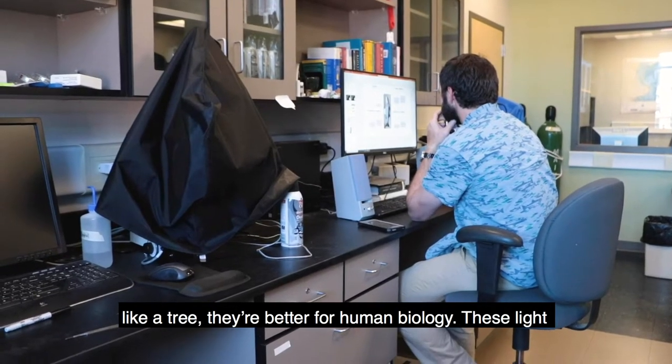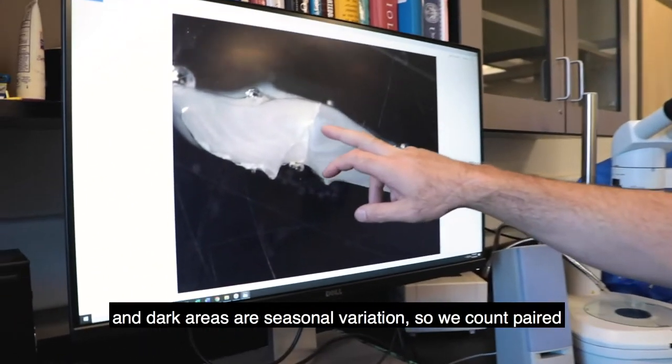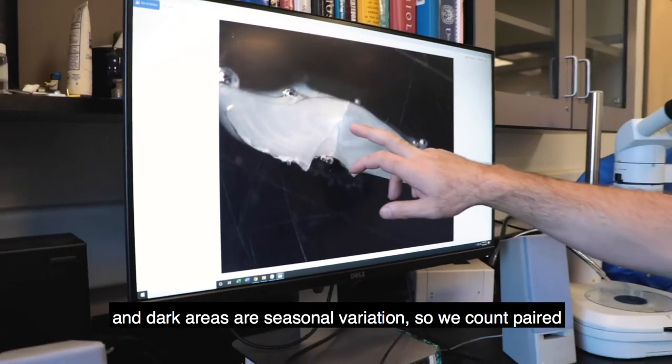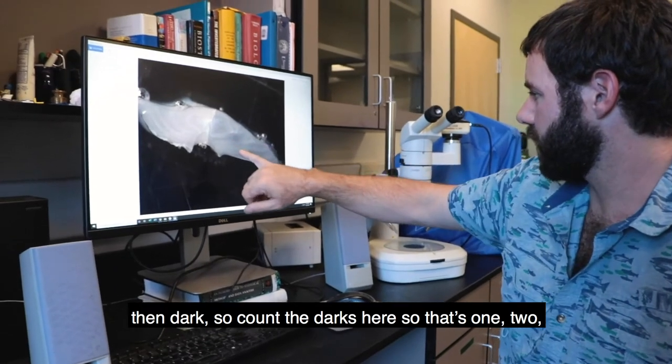Unfortunately ours don't grow rings like a tree, but probably better for human biology. These light and dark areas are seasonal variation, so we'll count pair bands. This one is white in the middle and then dark, so we'll count the darks here.